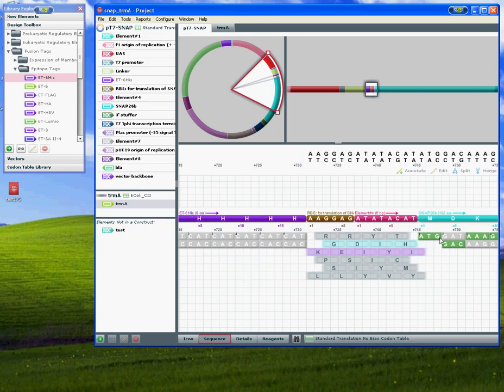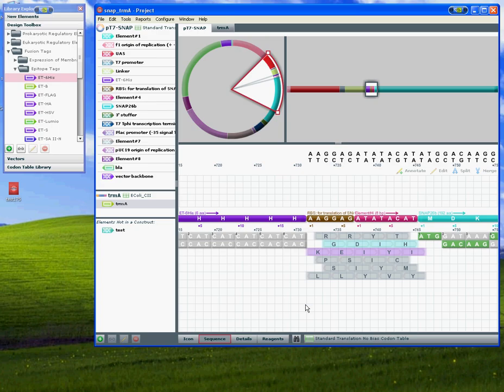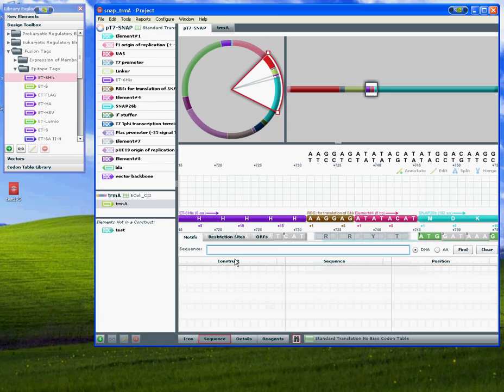You can change the codons as you please by just clicking on them. You can find sequences using the find function, either search by motifs, by restriction sites, or find open reading frames.